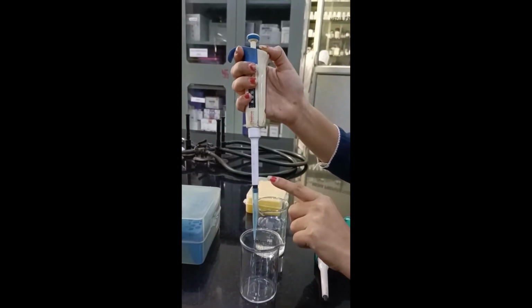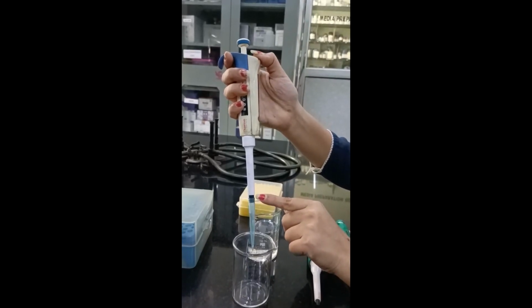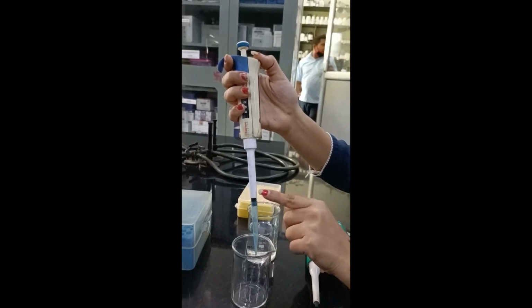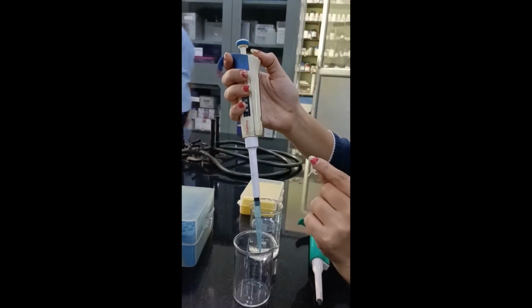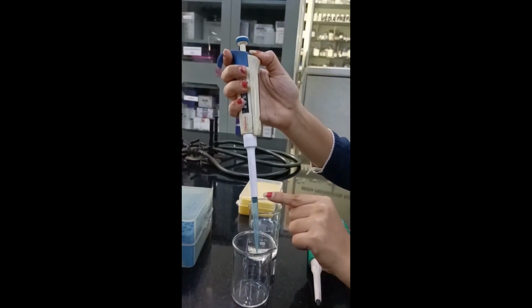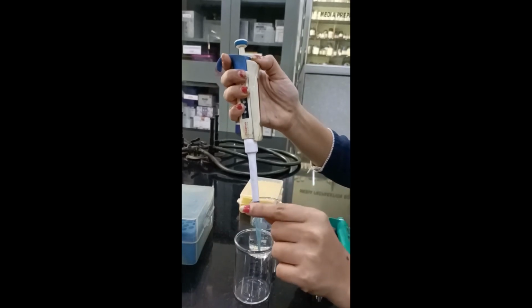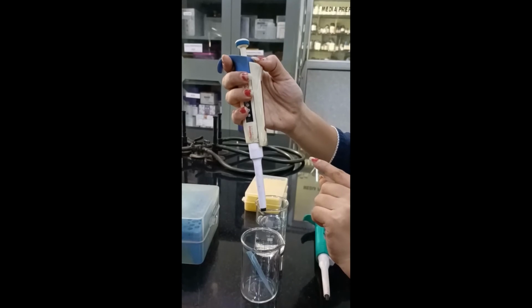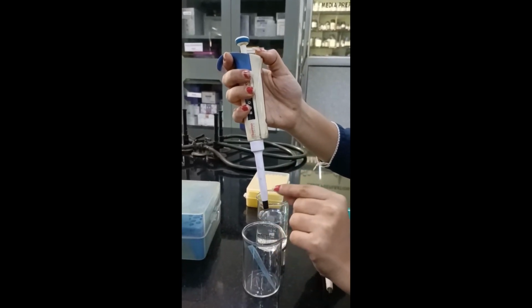As it has been pressed, can you see one end of the micropipette is moving ahead, touching the micro tip and giving pressure to the micro tip to move it out from the micropipette? So you have to press it over here and remove the micro tip from the micropipette.